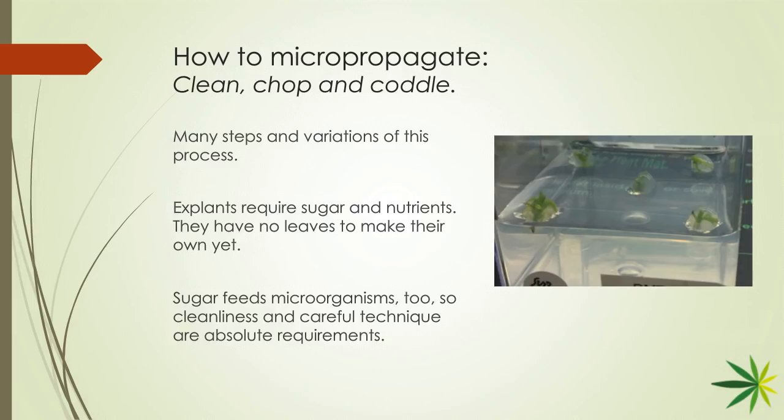And the chemical composition of both of those gels in that picture are kept as similar as possible because they will be eventually anyway by diffusion there. Treat them gently, and if you do it right, you will see growth cracking out of those beads, sometimes honestly within 48 hours or less. Oh, wow. If you're doing it right and you have your conditions right, including the quality of your starting material, that's great.